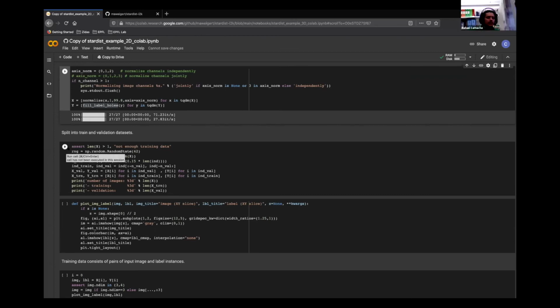Sorry, Martin. Yes. Something popped into my head. What happens if at some point you do this normalization also during analysis, and what if you are in a bad luck where you crop an area where there is no nucleus? Yes, that is something that you should avoid.